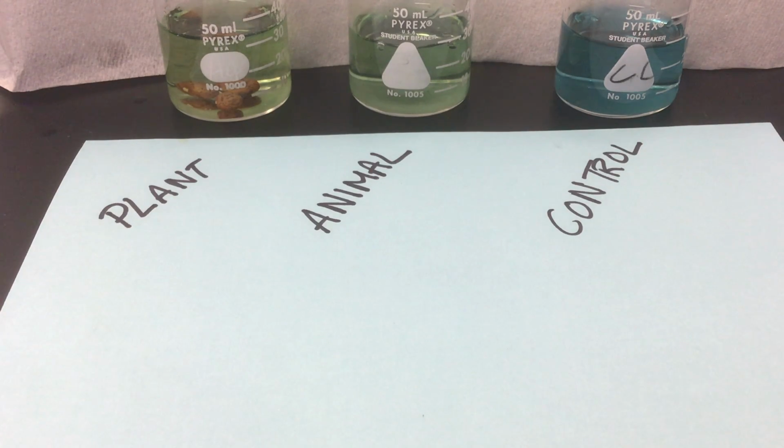All right, that actually looks pretty good. It looks very similar to the bean color. So what I'm seeing right now for my results, my actual data, would be that a plant has a color change, an animal has a color change. Our control group remains the same, which is good.